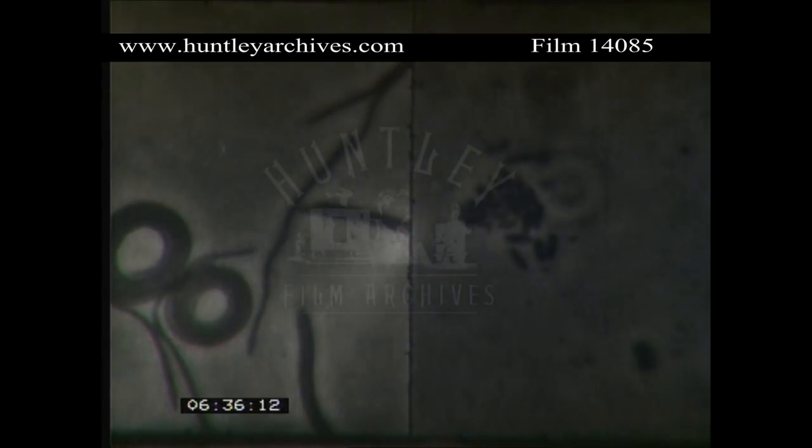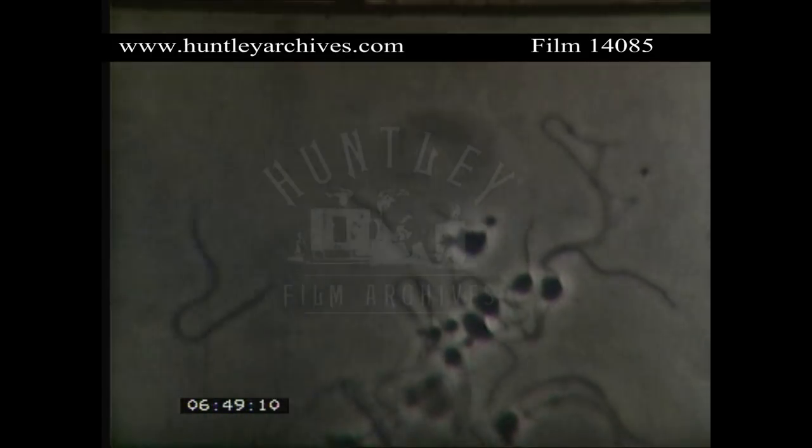For half a century, the effect on bacteria of antiseptics and other forms of trauma has been known. Many of these produce distorted long forms by interfering with cell division. Similar forms are also seen when penicillin acts on organisms in subinhibitory doses. The effect can be well shown by studying Proteus vulgaris by time-lapse photography. This sequence, showing normal growth, is speeded up 700 times.